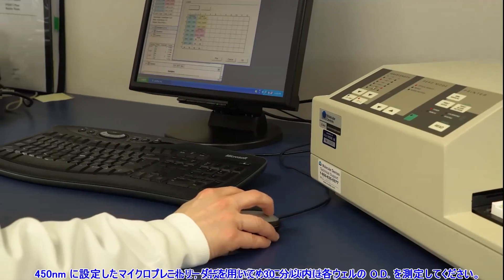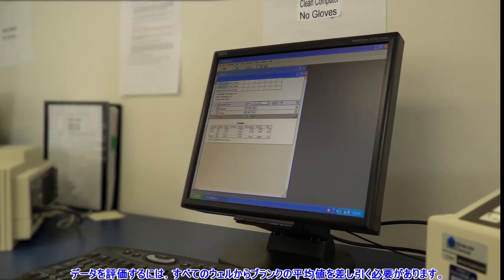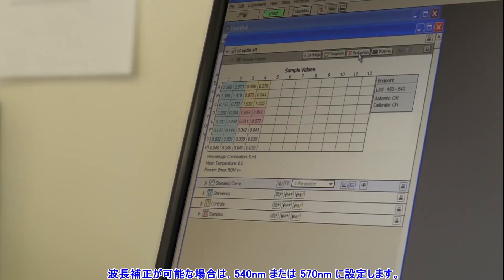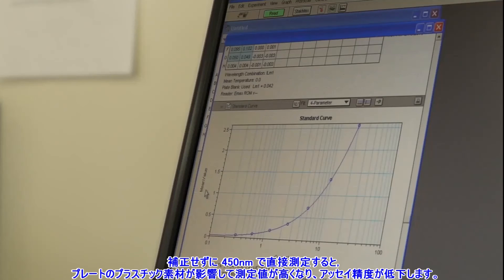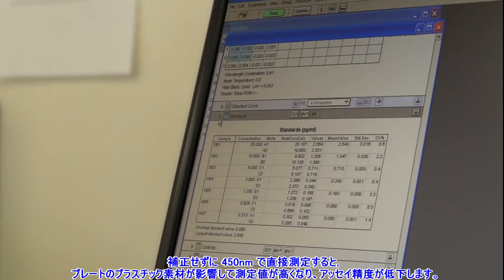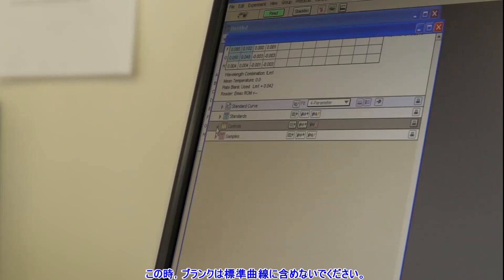Now you can collect your results. Determine the optical density of each well within 30 minutes using a microplate reader set to 450 nanometers. To evaluate your data, the average of the blank wells should first be subtracted from all wells. If wavelength correction is available, set to 540 or 570 nanometers. This will correct for optical imperfections in the plate. Readings made directly at 450 nanometers without correction may be higher and less accurate due to the slight imperfections in the plastic of the 96-well ELISA plate. Plot your standard curve and read controls and unknowns off the standard curve. The blank wells should not be incorporated into the standard curve.